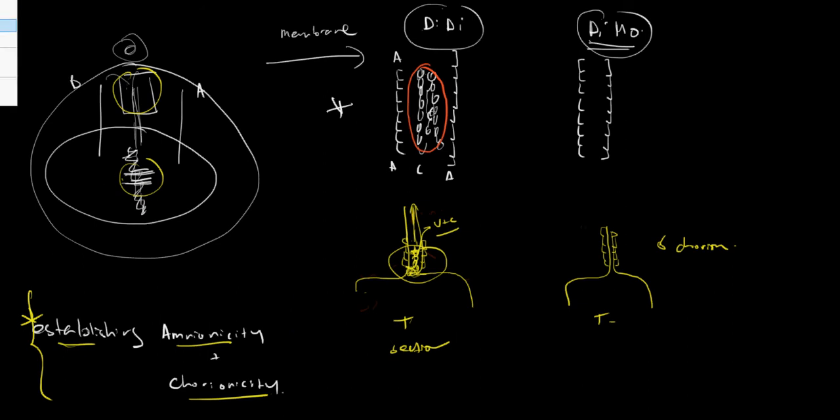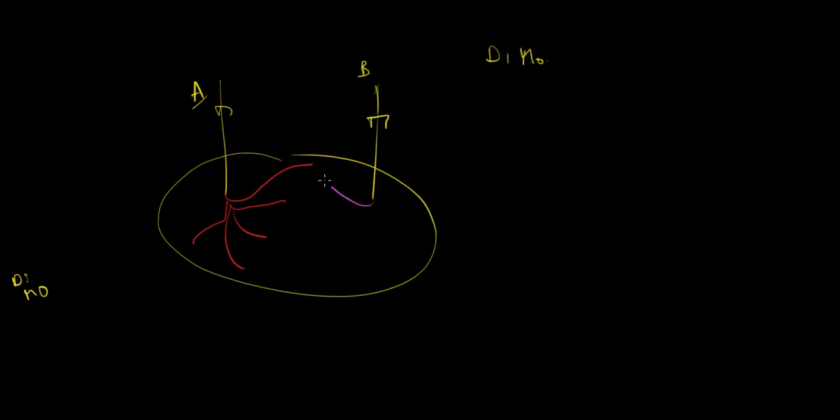The other thing is, assuming that you have a case of either a MOMO, which is unusual, monoamniotic monochorionic, or a diamniotic monochorionic twin placenta, and let's say this is twin A, and they often mark it with one cord clamp, and twin B, and that's often marked with two cord clamps. So this is your di-mo placenta. So in this scenario, you need to look for vascular anastomoses. And so if this is the umbilical cord, what will usually happen is that the vessels will ramify off the umbilical cord, and let's draw the vessels of the other twin like this, and there's usually an equatorial plane between the two vessels.